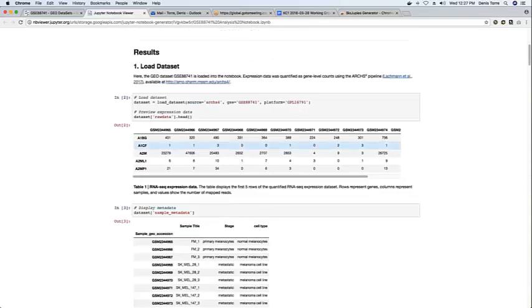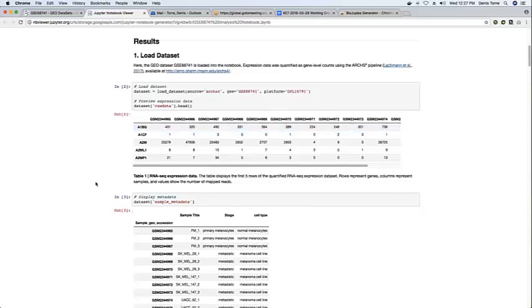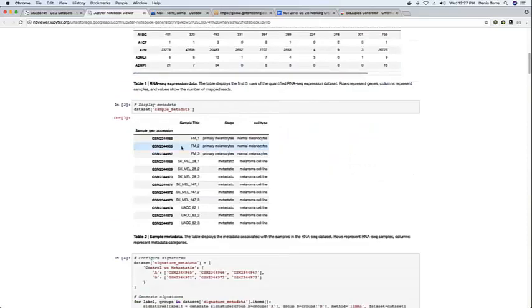So for example, here we can see how the dataset is loaded. So here we have gene expression data for over 30,000 genes and the 18 samples in the dataset.